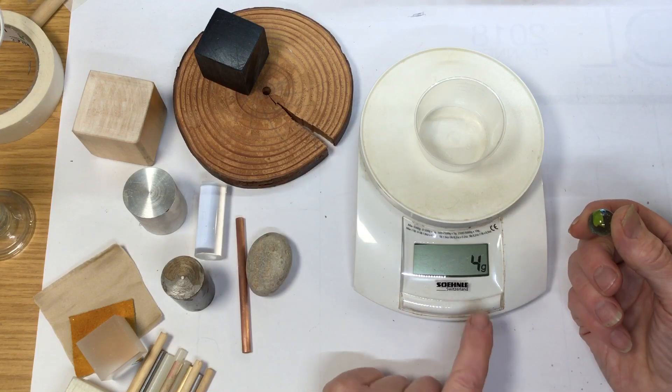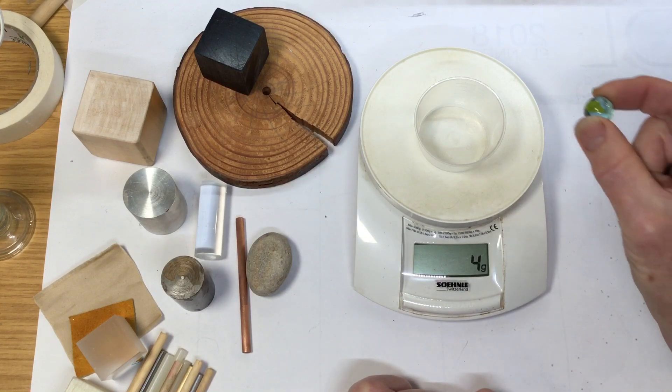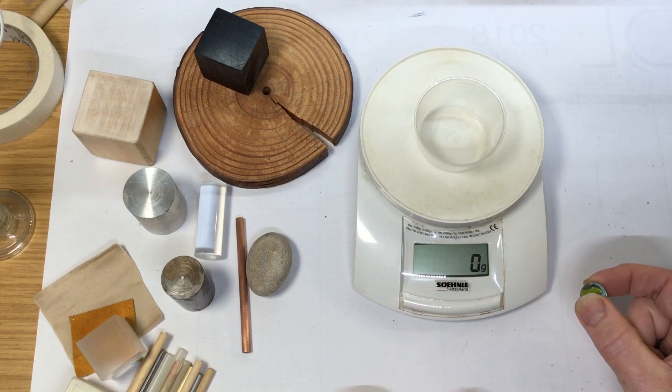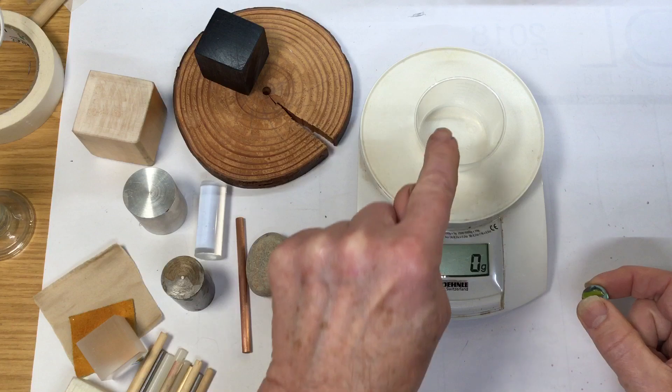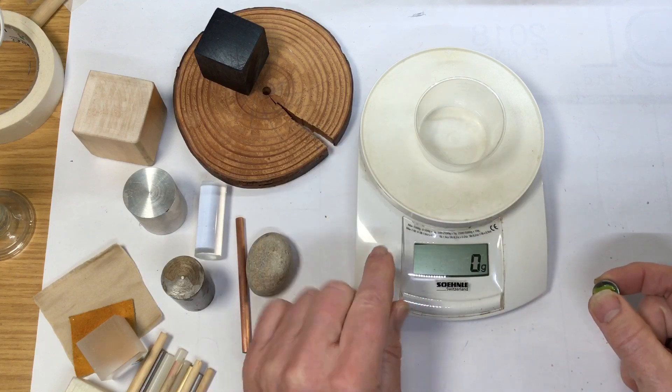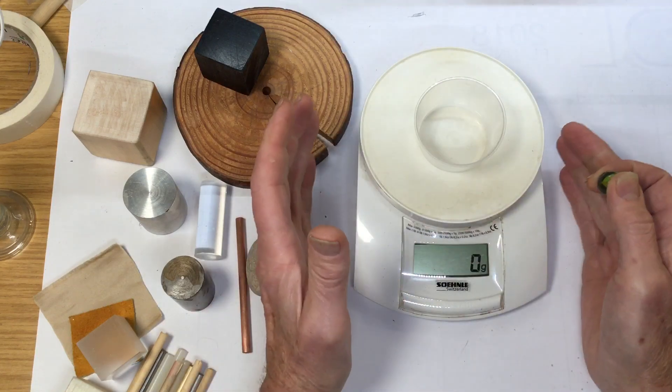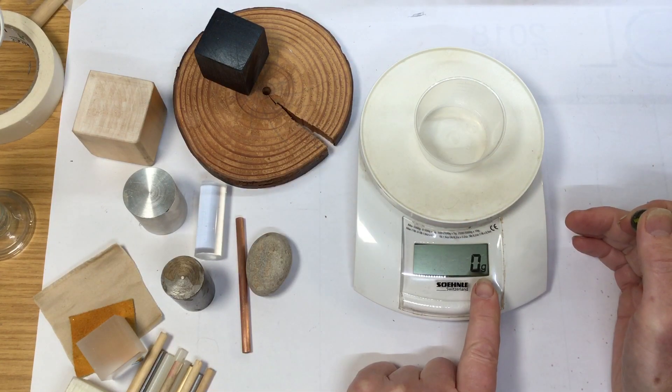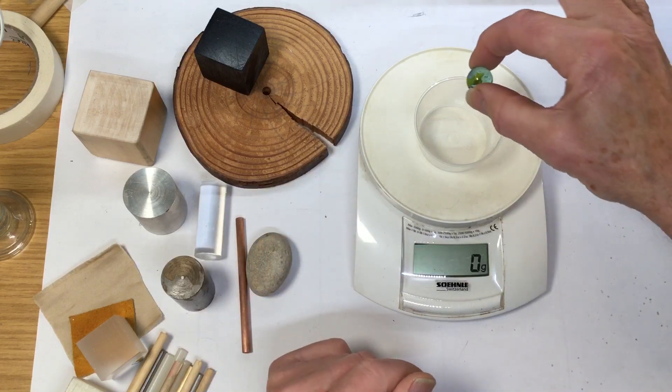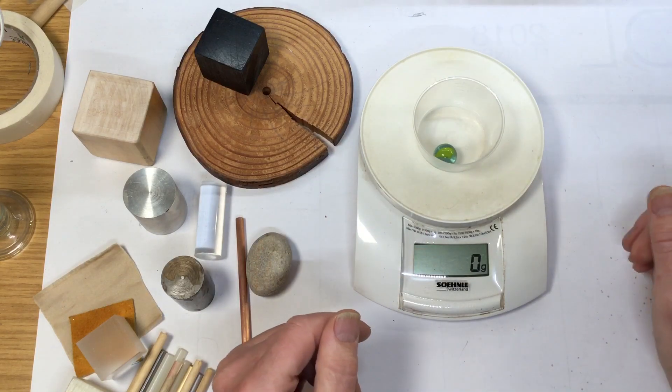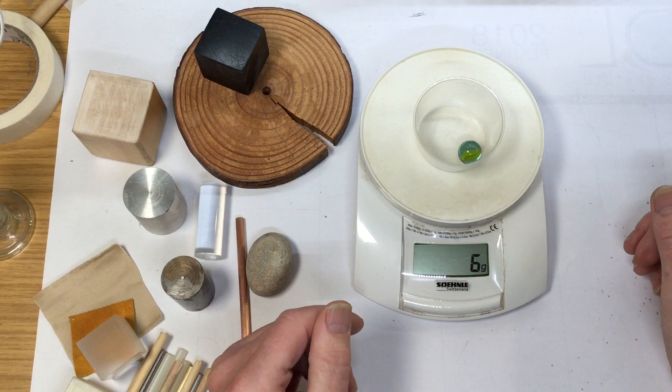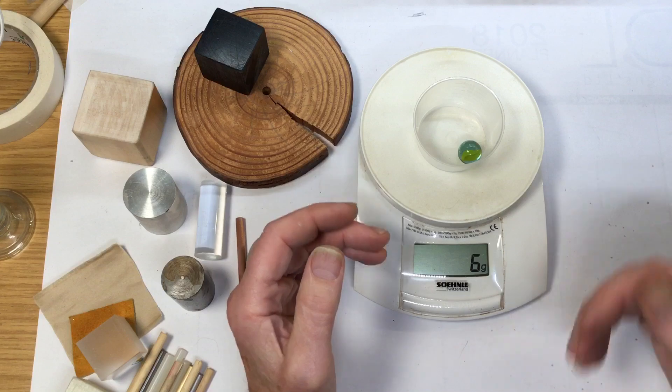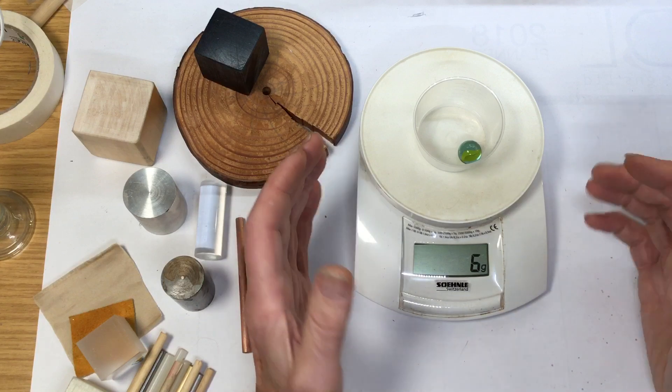Put the marble in - no, wait, let's just press the button again. Zero. So what it's doing is recalculating - the whole scale pan and whatever you've just put on it has zero mass. It's done the subtraction for you. Now when you put the marble in: six grams. The tare feature is very useful.